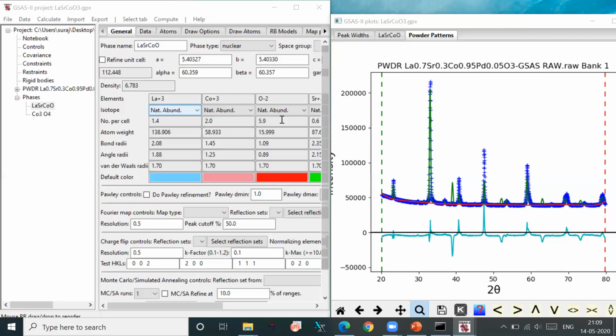Now it is very important to take one system. That day Shahnaz was saying that nickel oxide is a very simple system to practice this. I think Sonu will share this with everybody. You have to go through it, and maybe try nickel oxide, maybe zinc oxide, the simplest systems, from the soft data that we have. All of you must try to fit that on your own.